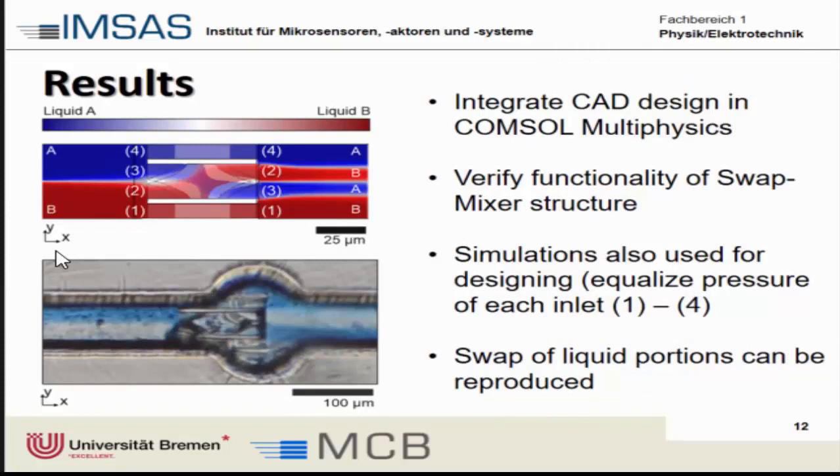One of the advantages is that we use these CAD designs to directly connect to the microchannel — we can integrate the CAD design directly into a simulation and verify the functionality of this mixer structure. The outer channels should remain in direct contact with liquid A for example. It shows quite well that from the left side we have two liquids coming in, one dyed with blue and the other is clear, and even if we miss the edges a little bit, the functionality of the device works really well.